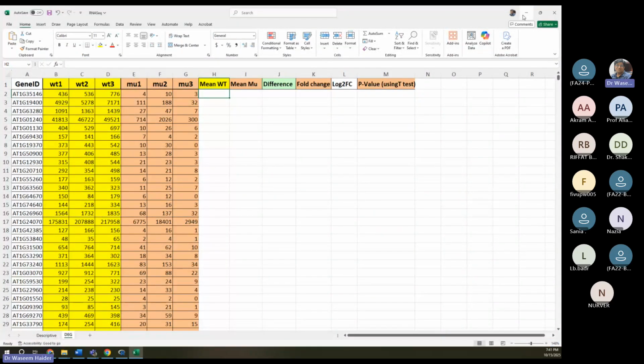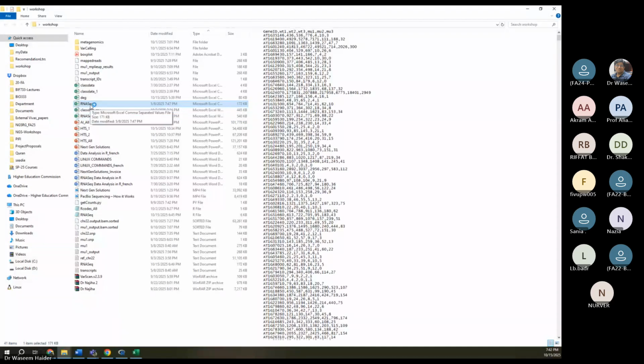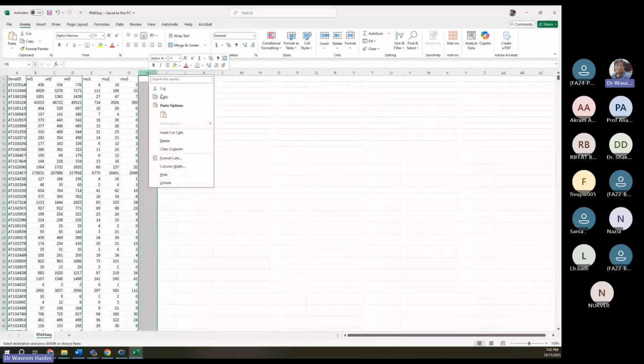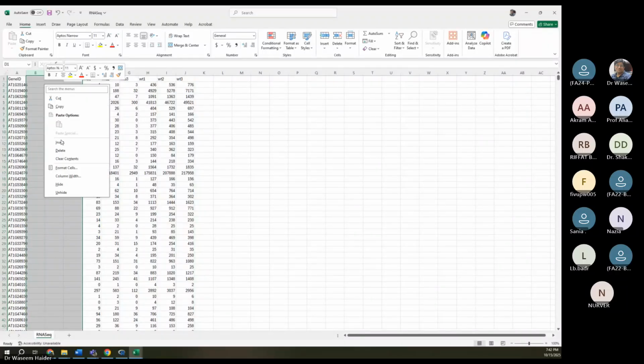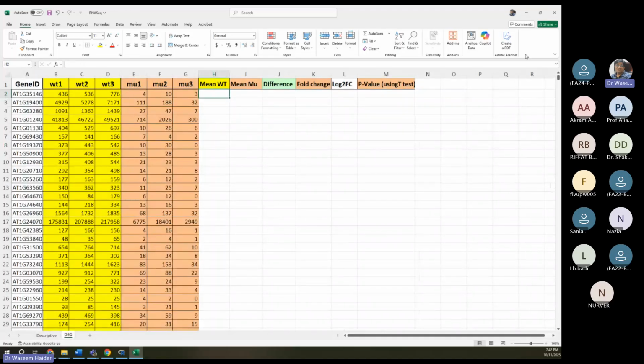So where is my CSV file? This one, sorry. So what I can do is cut. That's very important because then your whole result will be changed. My apologies. I can fix it in the code as well, but that will make it a little bit uglier for you since you are already understanding the things. So I don't want to run into more code.